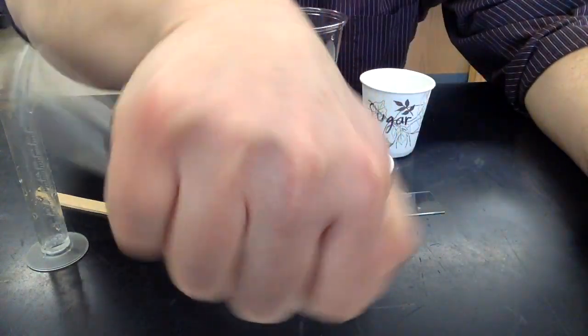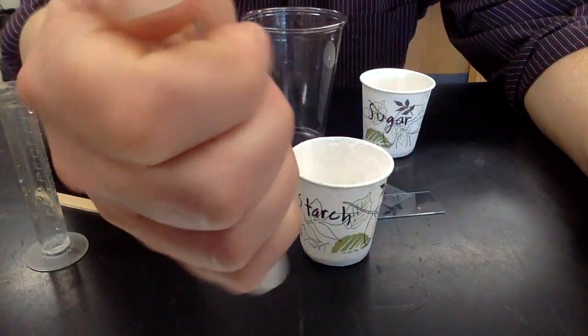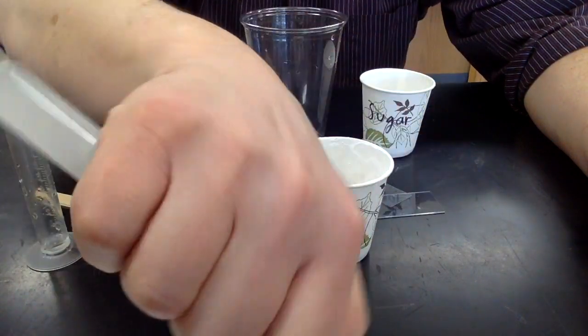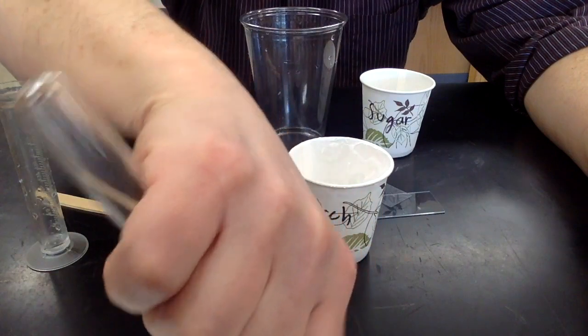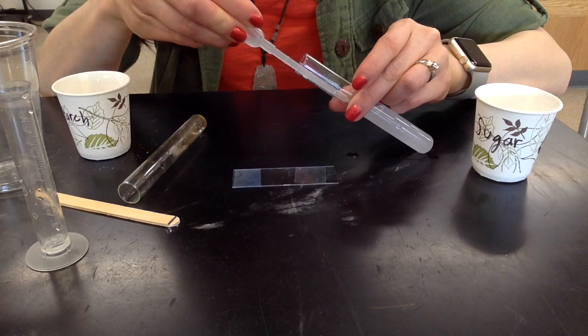Do the solubility test by shaking it back and forth to see how it reacts. Do this with the starch and make some observations. Then you will repeat this process with the sugar.